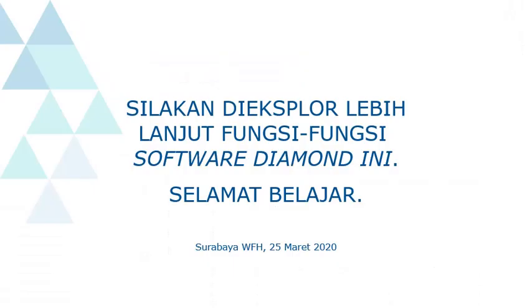That's all for now. Have a great time working with Diamond software.